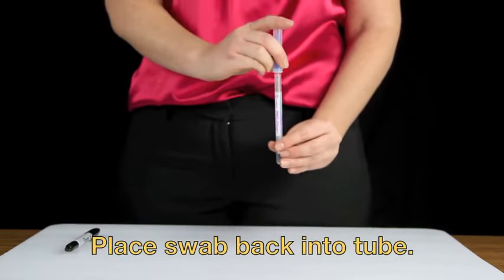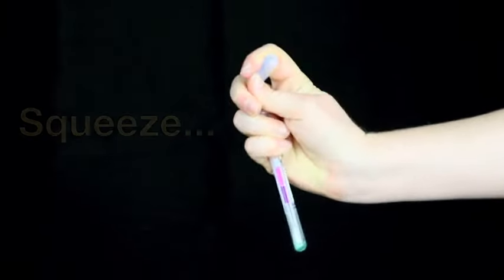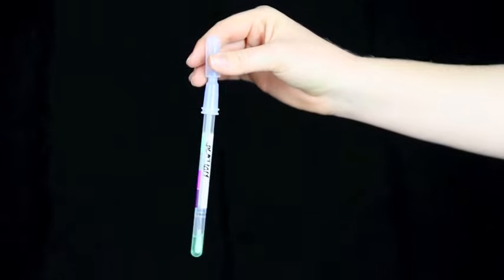Replace the swab in the tube. Hold the swab tube firmly and use the thumb and forefinger to break the snap valve by bending the bulb forward and backward. Squeeze the bulb twice to expel liquid down the swab shaft and shake for 5-10 seconds.